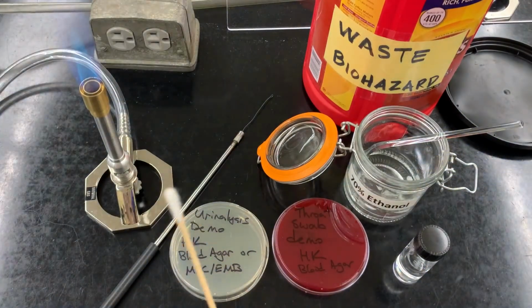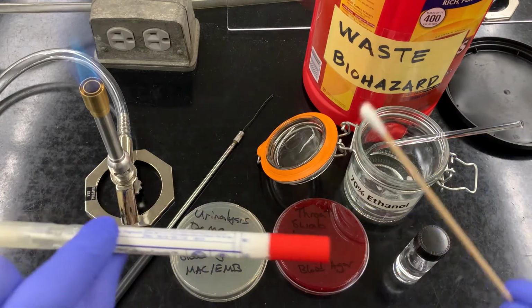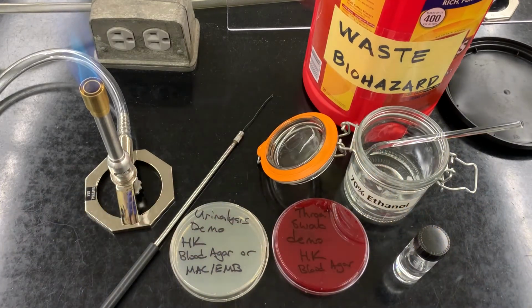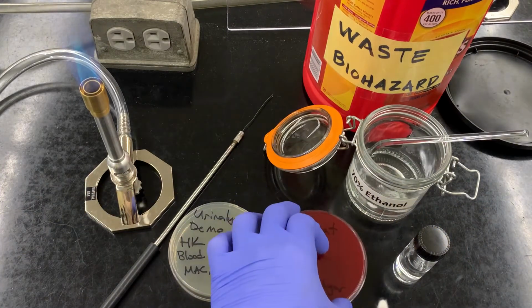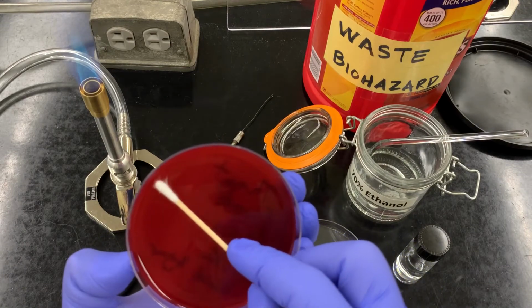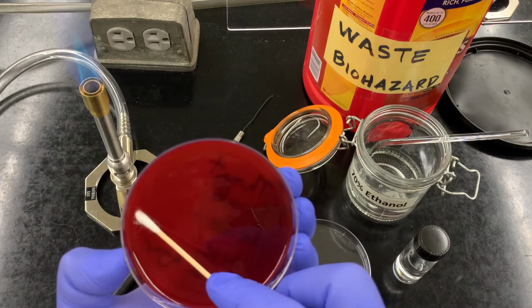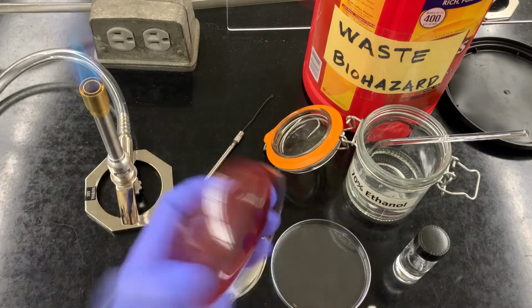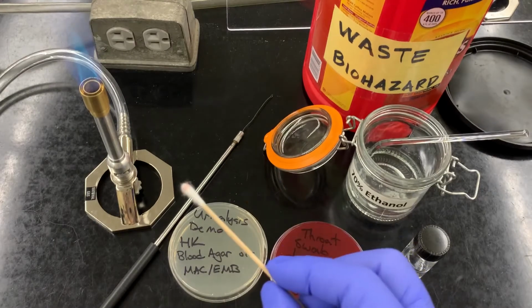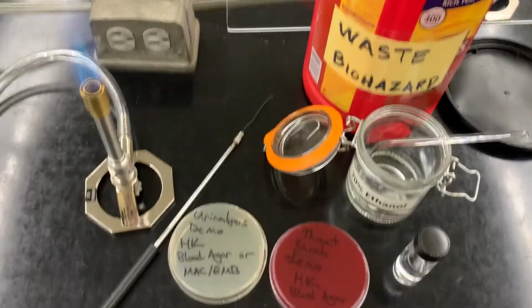And then now we have our swab, right? Once again, normally we would stick this into our transport medium, right? But we are going to go straight onto agar. So simply take your swab, and then you're going to make a Z. Zip. As I'm turning, I'm going to make a Z like that. Okay? So just make a Z, and then make sure you rotate your swab as you do it. This is biohazard, so I'm going to throw this away.